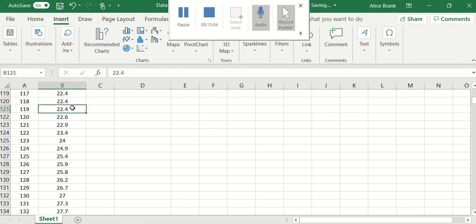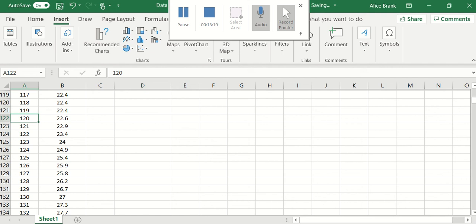Do you see how it jumps and then starts to go up? That's how I detect it. You can do 119 or 120. What do you think? It went up a lot. Let's say 120. Let's do 120. Okay. It went up a lot.